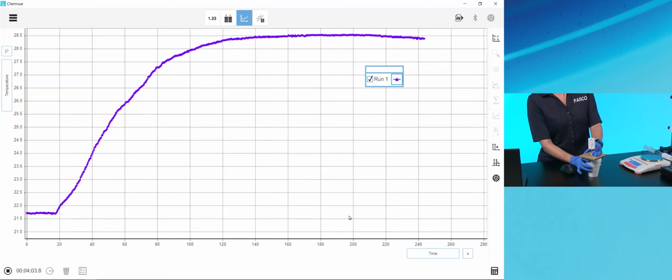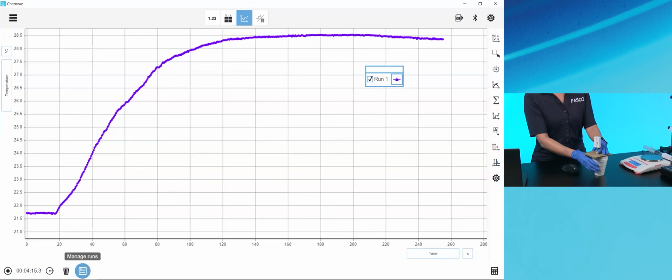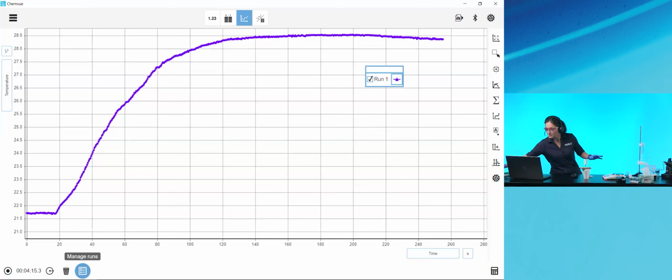I misspoke there. So it was 200 as what I guess my peak was. I'm well past 30 seconds beyond 200, so 230 would be right around here. So I'm good. I can stop collecting data, and I would repeat this each time I do a run. Now, I am going to only do one run, but I do have some saved data that I can share for more discussion of analysis. Let me move my equipment aside here.